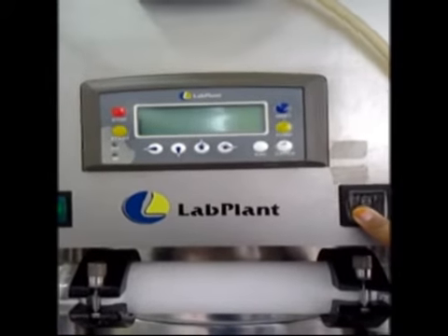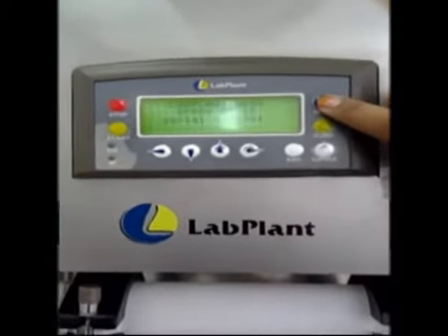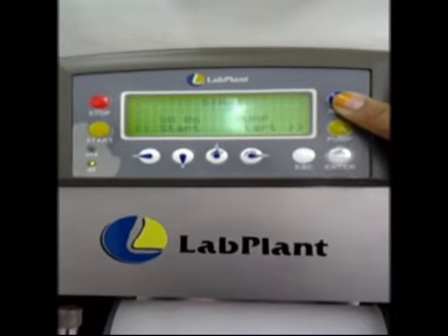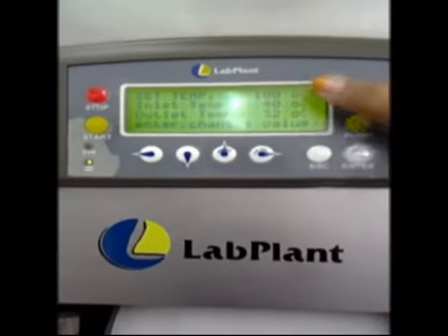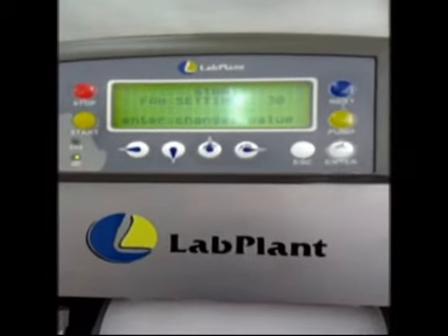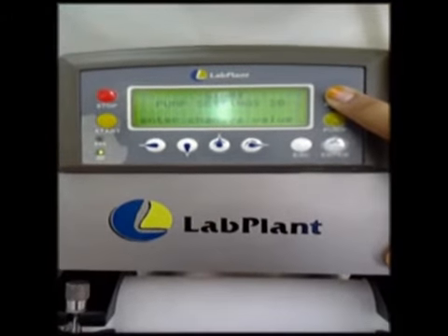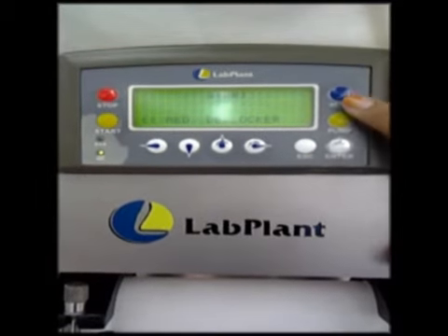Switch on the main power and a display will appear, showing the oscillating spray dryer. Then press the next button, and start will appear. Press the setup button. Press the next button to set up the temperature. Press the next button for the fan setting, and press the next button for the pump setting. Lastly, press the next button for the deblocker.